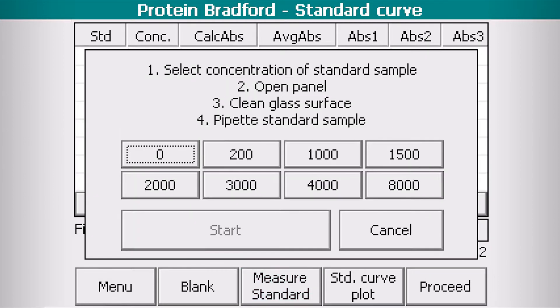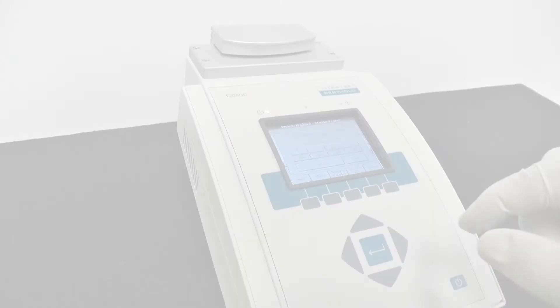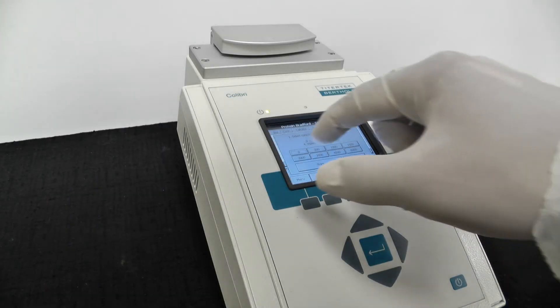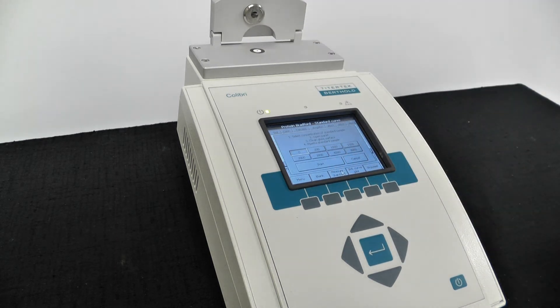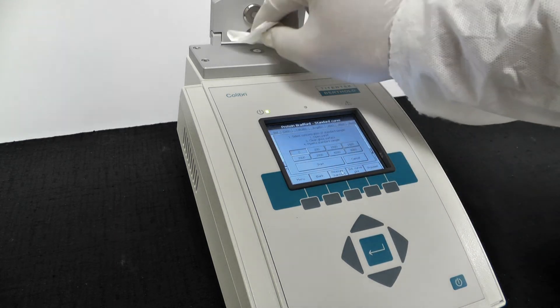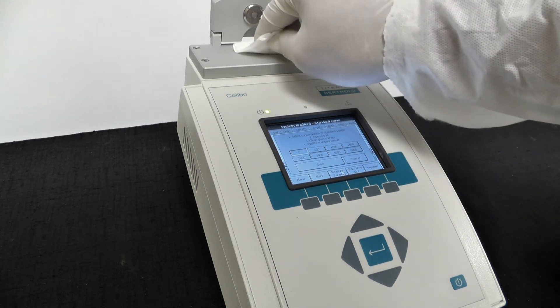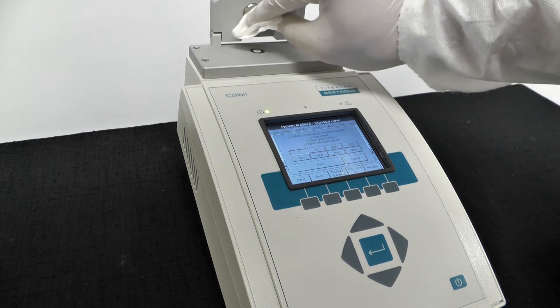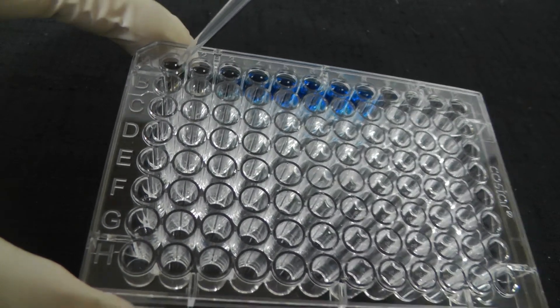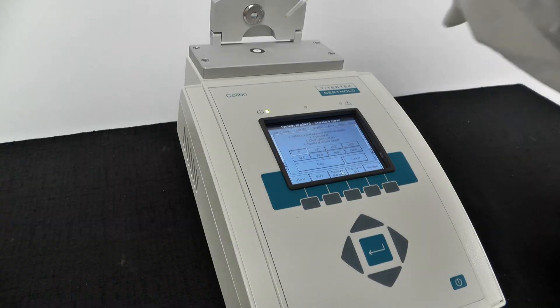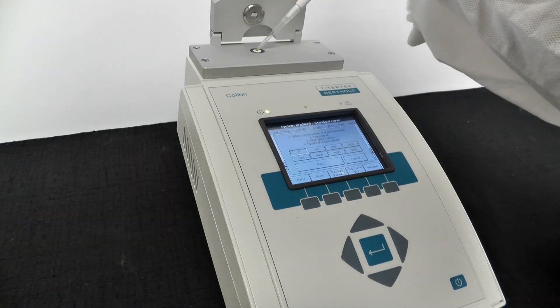Select Measure Standard. Begin by selecting your reference. Open the panel and clean the glass surfaces. Pipette a drop of your reference, close the panel, and click the Start button.